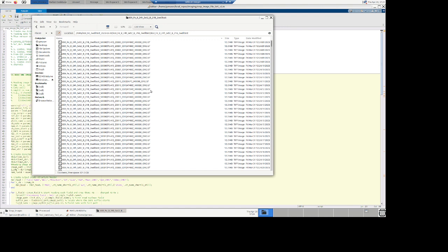So you have this kind of marker. This is a labeling technique to distinguish the type of these blood cells. Those are marking 2 different CDs. I forgot which ones they are, but CDs are specific markers for cells. Let's say you have one that is positive for 594 and negative for 647, that defines one type of cell. You can see all the combinations you get: both off, both on, one on and one off. That's 4 possibilities, so that gives you 4 different types of cells that allow for further classification.